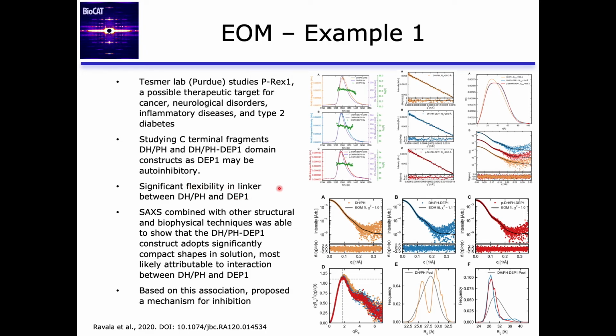We had crystal structures for both domains, and we collected SAXS data on the system with and without this DEP1 domain and this flexible linker. You can see here metrics of the SAXS data quality, which are good. And then we carried out EOM analysis on our systems.